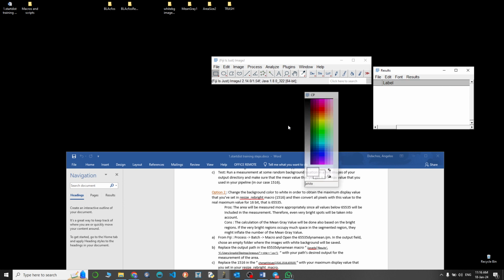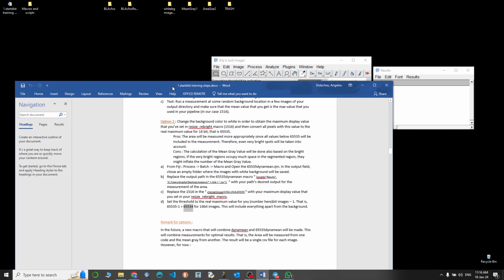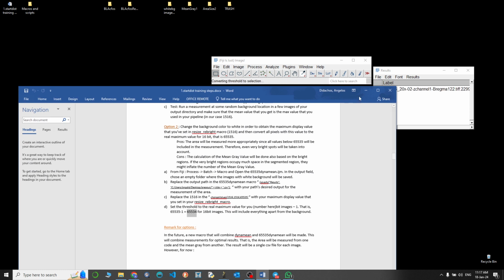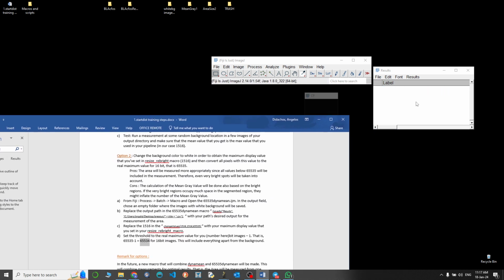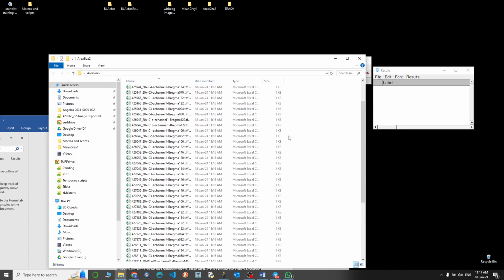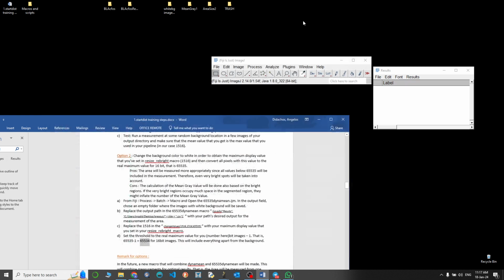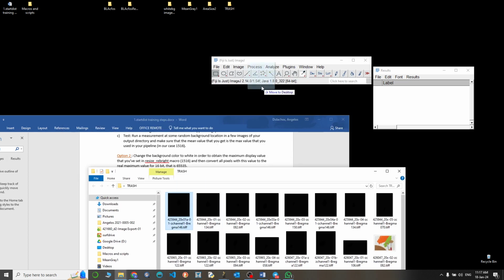And again, as you can see, it's running. We'll give it some time. Let's see how far we are. Seems that it's done already, which is good. So in the trash, you would see something similar to what we had.